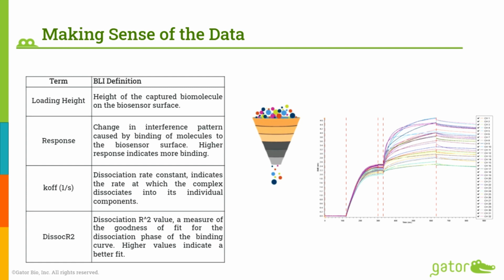So we'll only take samples that are above that particular height. Then we saw the K-off value, which was fitted by the software. And not only did we check for the K-off value, but we also wanted to understand the goodness of fit, because we have to go through thousands of values, right? So we might interpret or misinterpret the data.